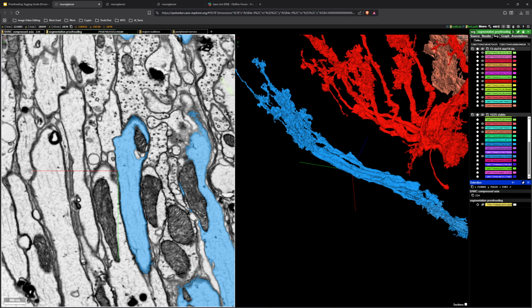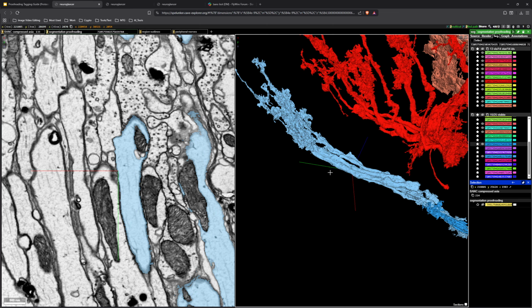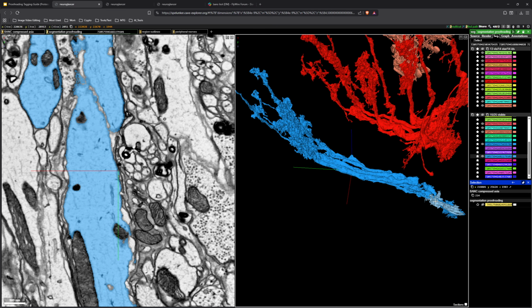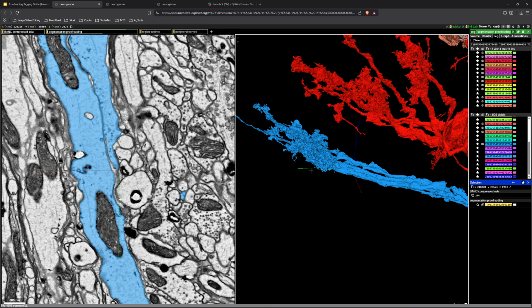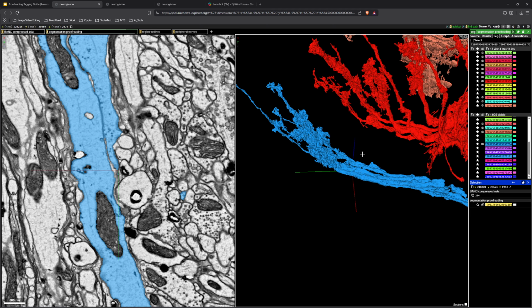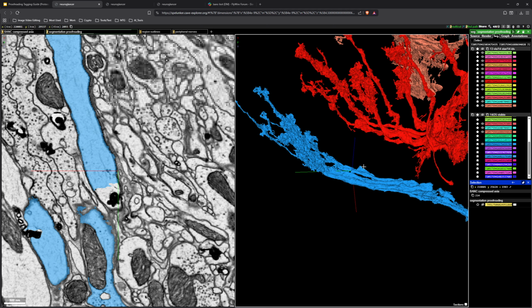And then in the task list, you can say ripped area, and in the notes, say bundle of sensory neurons, I uploaded 10 to banc-bot or something.